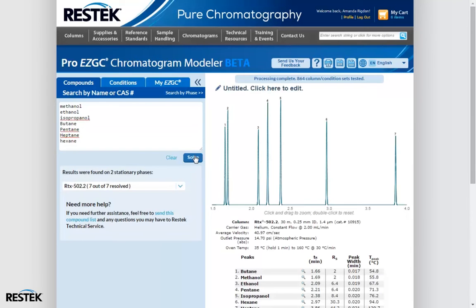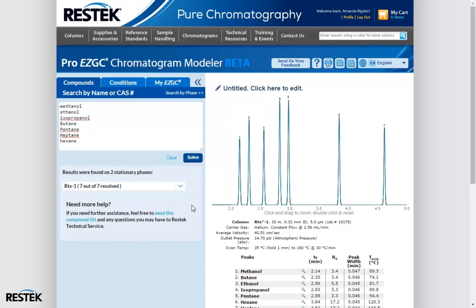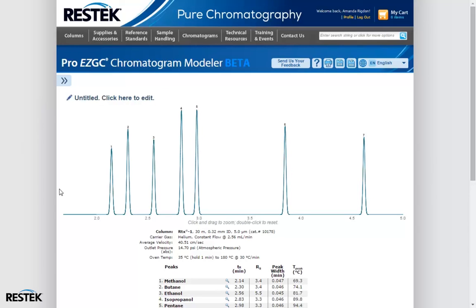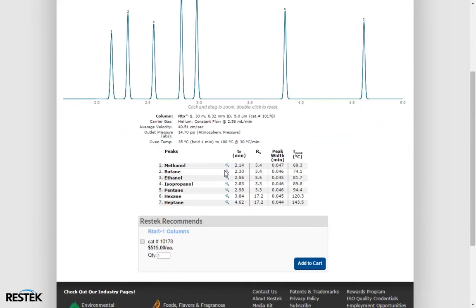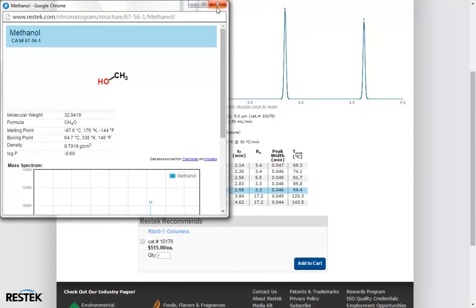What happens now is we have generated a model on the column where these compounds were modeled that has the best separation in the shortest amount of time. We can see results on two different stationary phases and switch between them. I kind of like the RTX-1 — everybody has those, I have one laying around in the lab. So let's use the RTX-1. We can see this in full screen, see details of each of our peaks if we hover over them, see the conditions used to generate this chromatogram, and even see additional information about our compounds of interest.